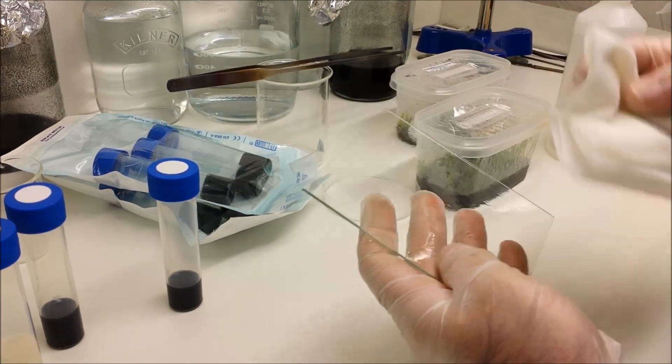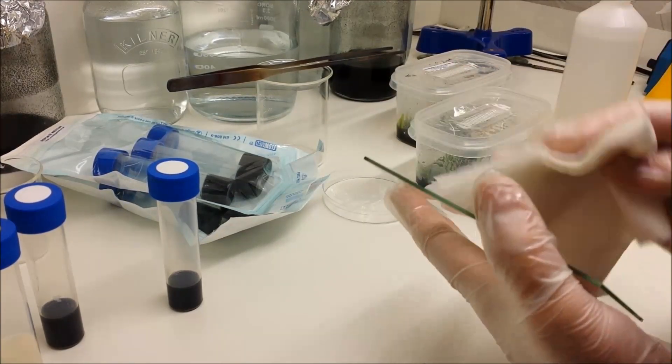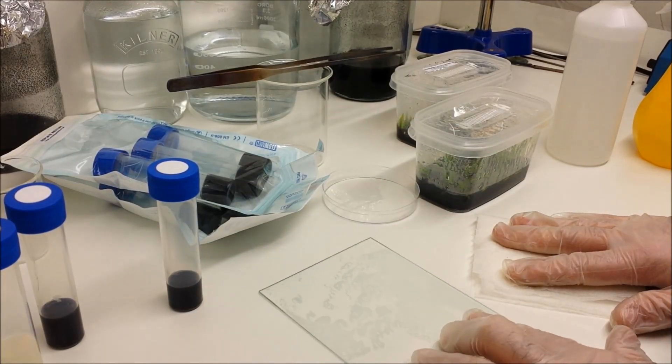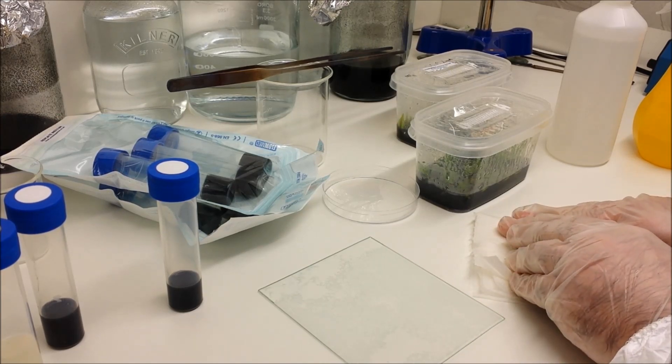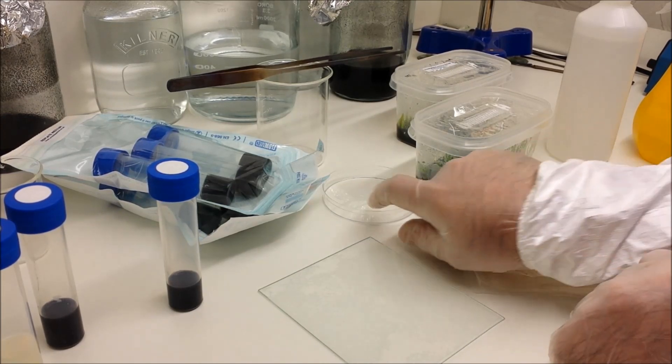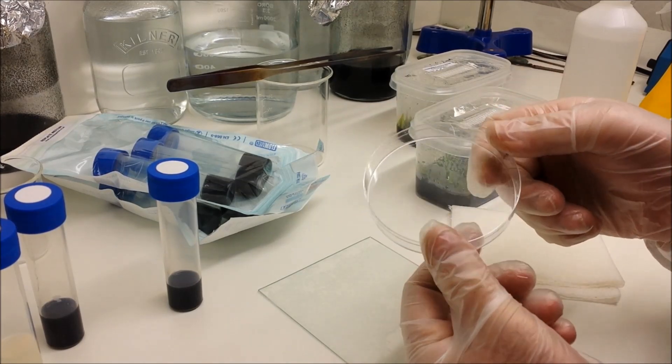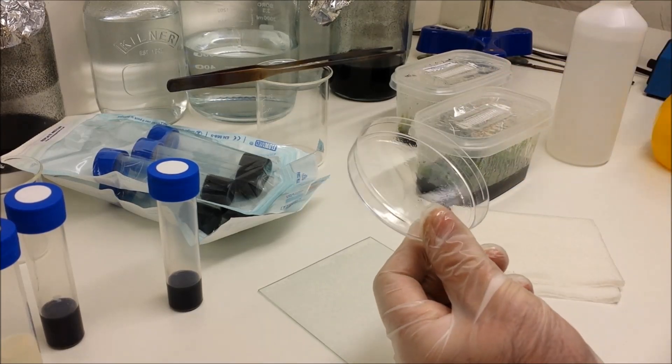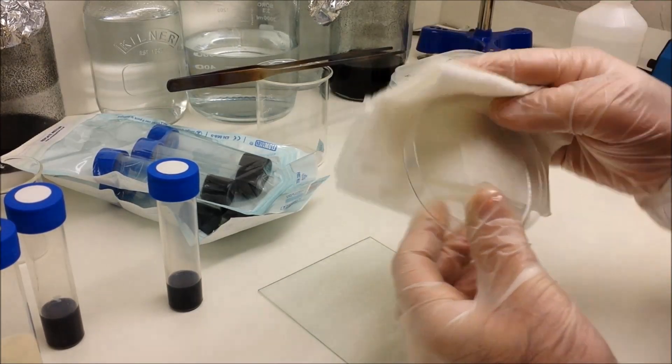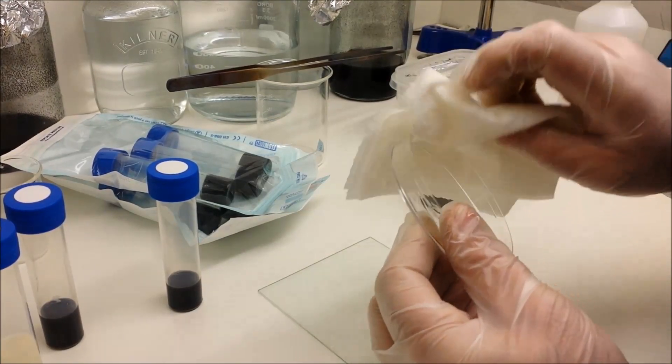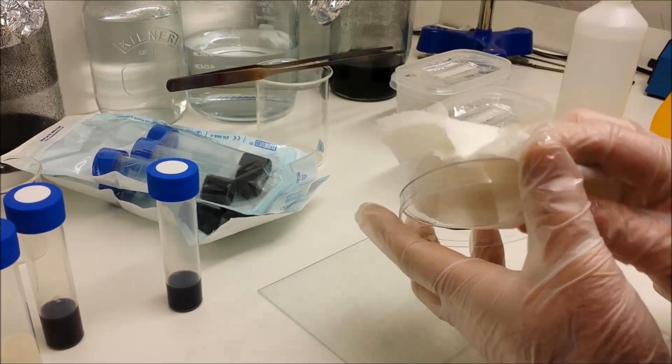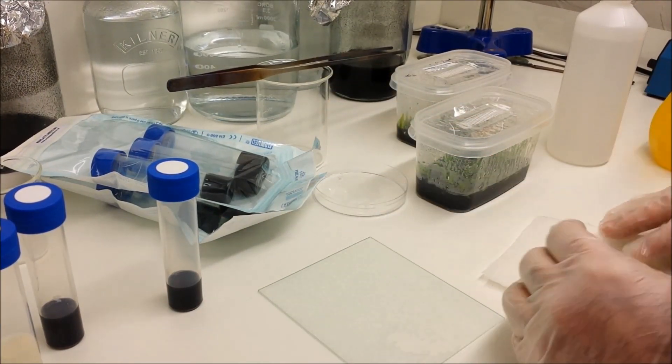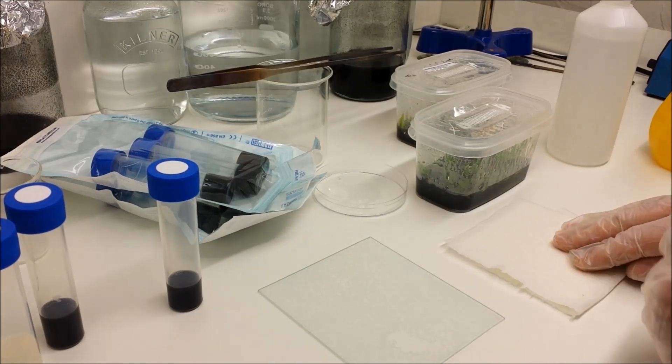What you could use instead of a glass sheet is some of the disposable petri dishes, which are pretty cheap. But again, what you need to do is sterilize it by spraying with isopropyl alcohol IPA, giving it a good wipe down—top, bottom, sides, everywhere. Put your cloth back down.